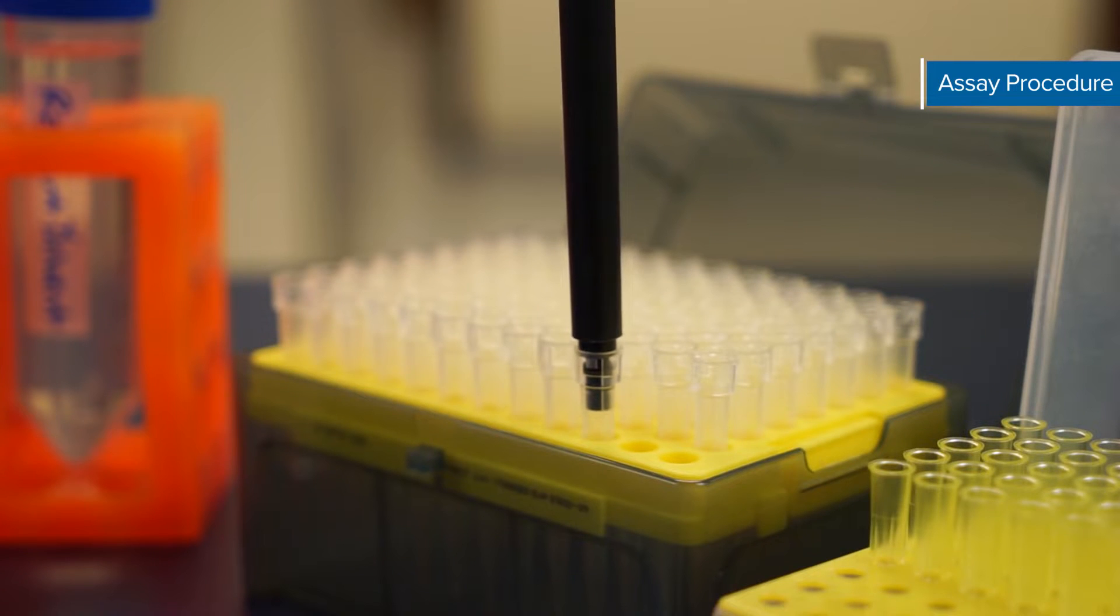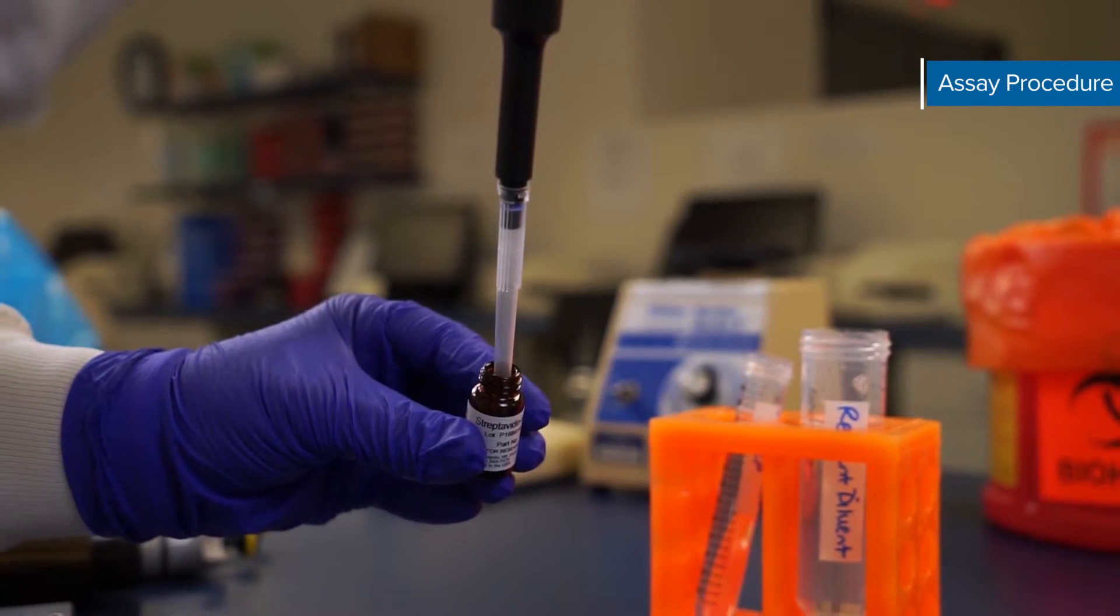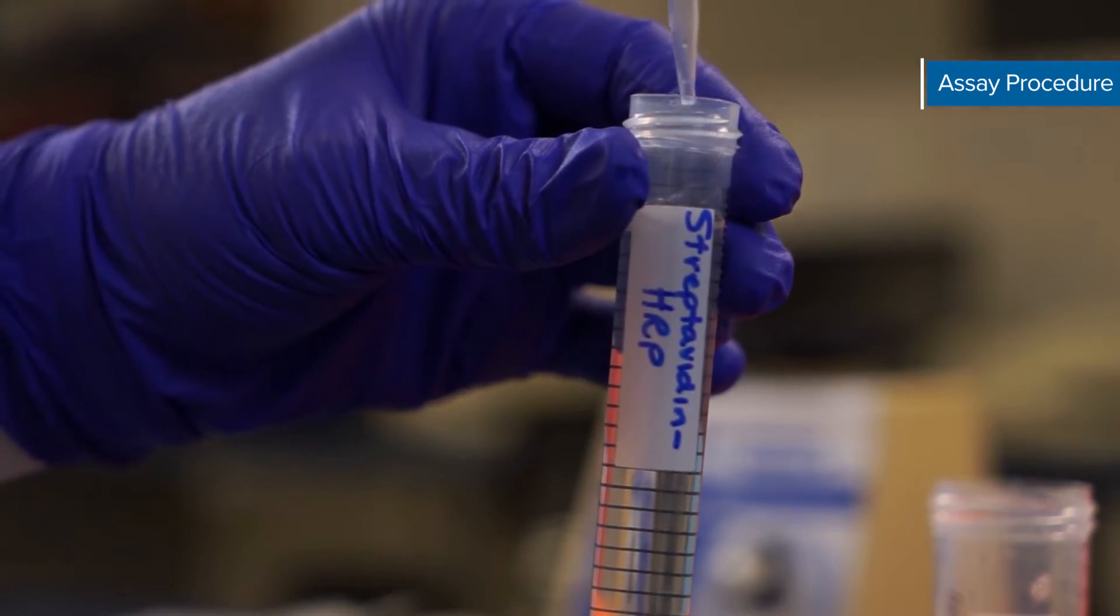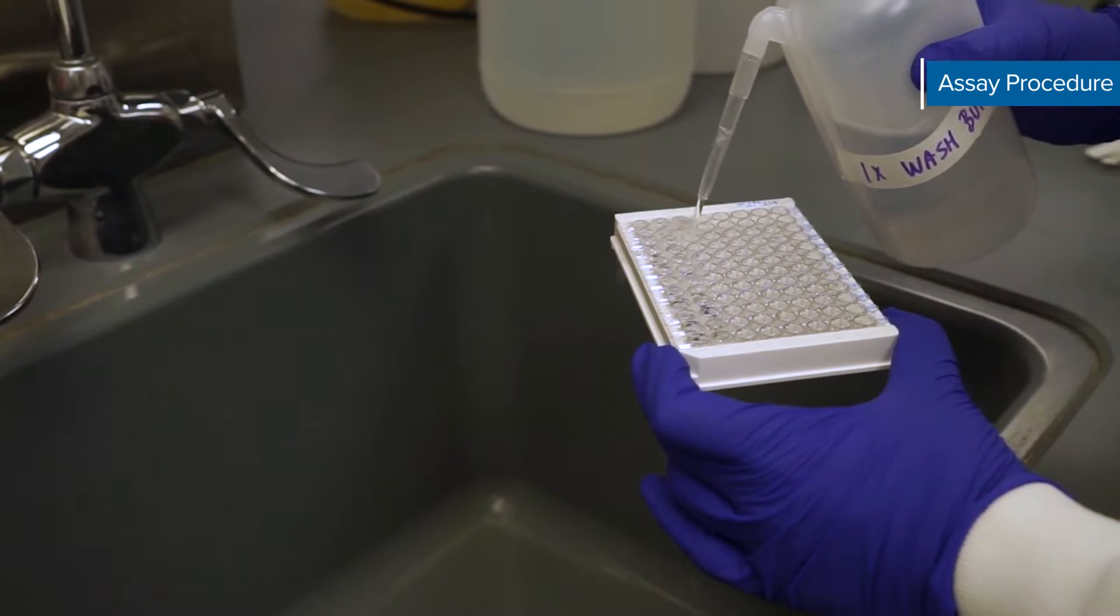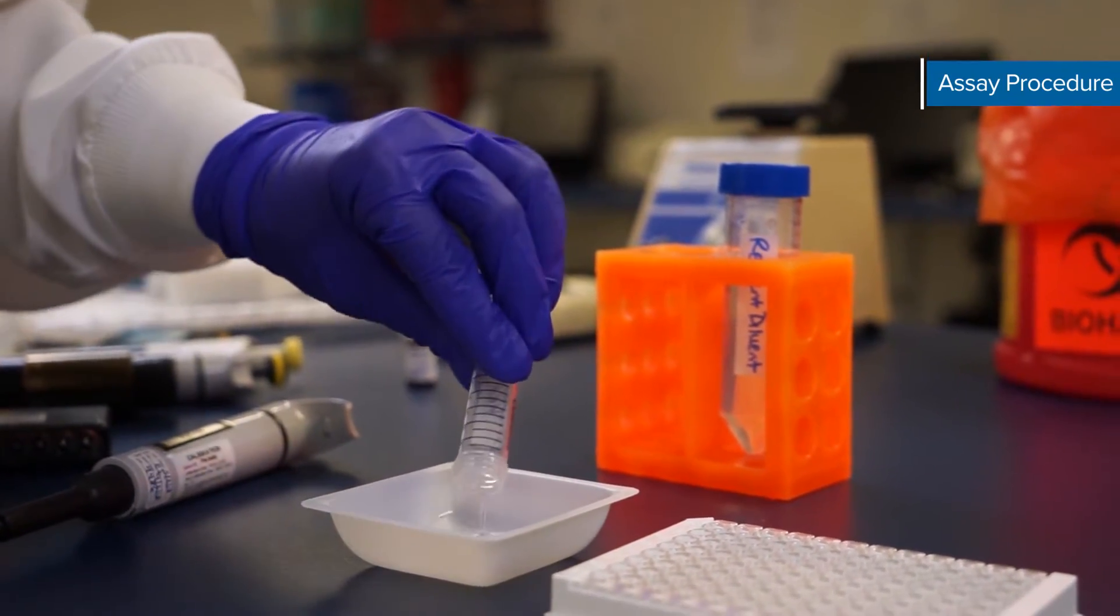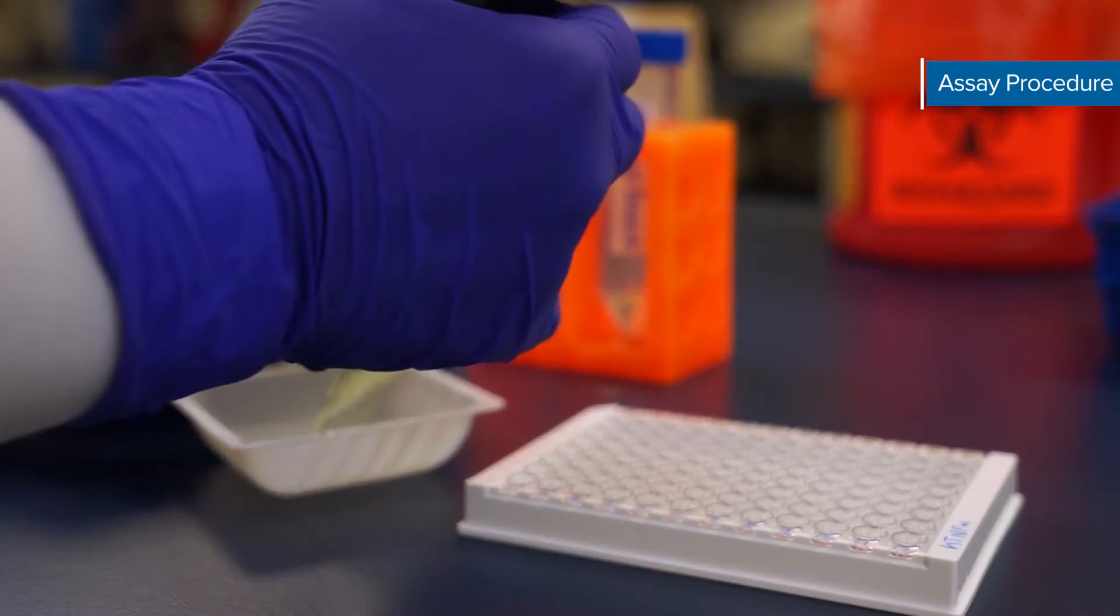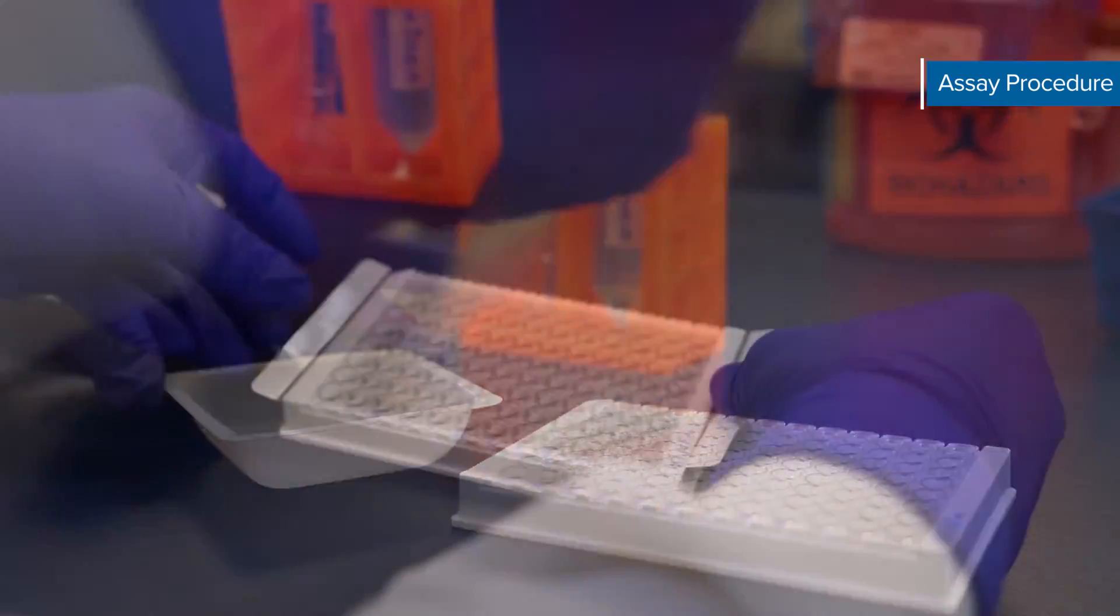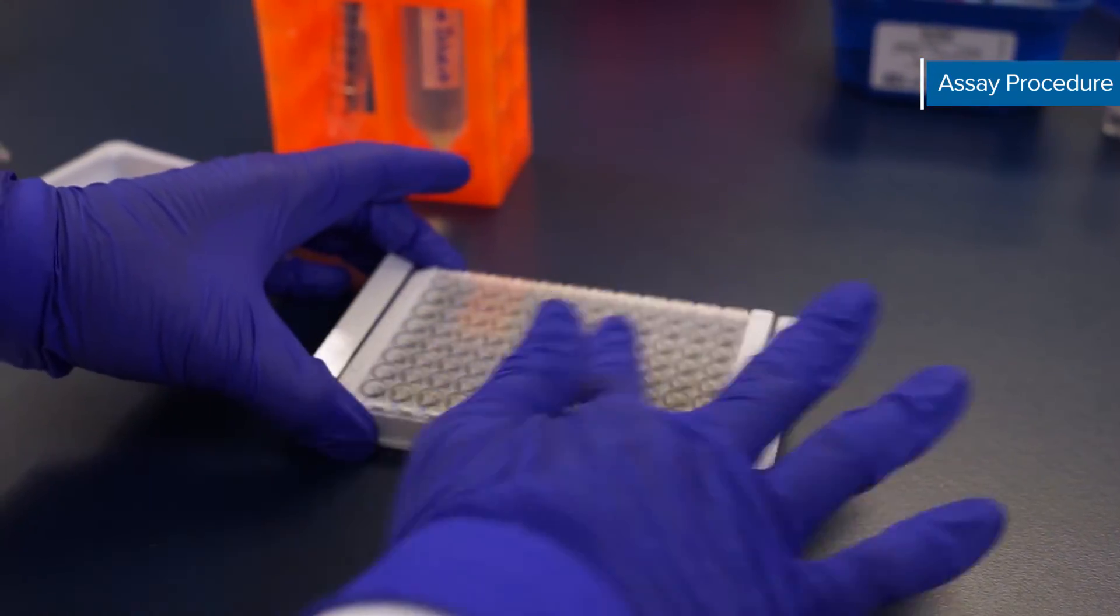During this detection antibody incubation dilute the streptavidin HRP in reagent diluent as specified on the vials label. Next repeat the wash step. Now add 100 microliters of the diluted streptavidin HRP to each well. Cover the plate and incubate for 20 minutes at room temperature on the benchtop. Avoid placing the plate in direct light.